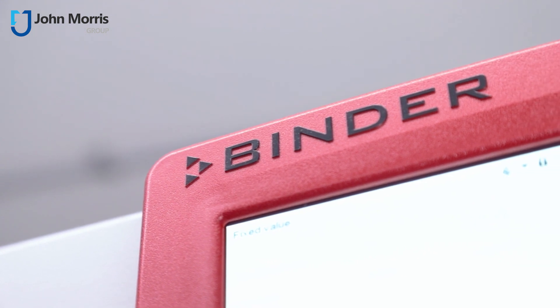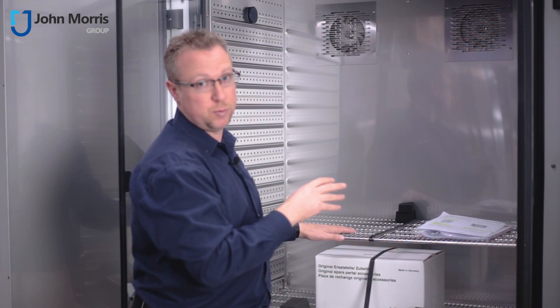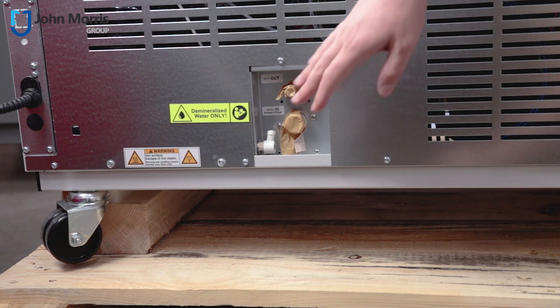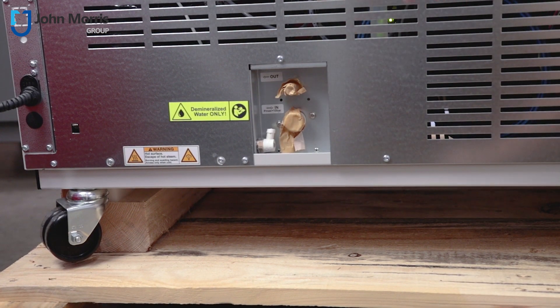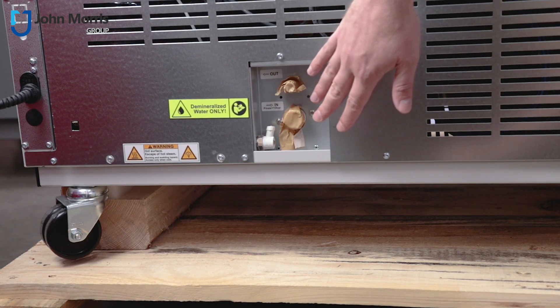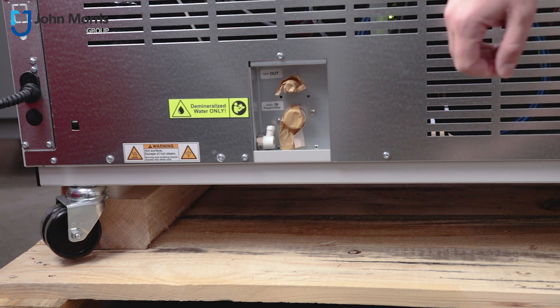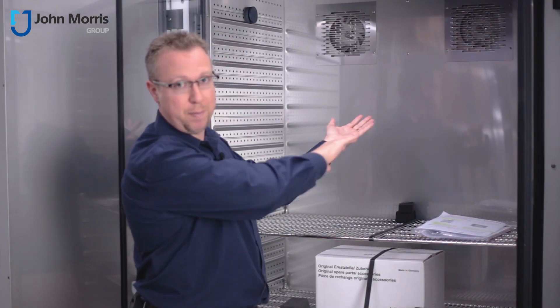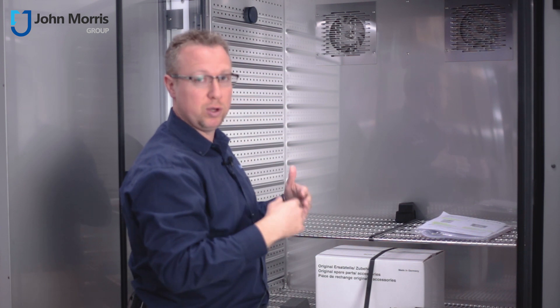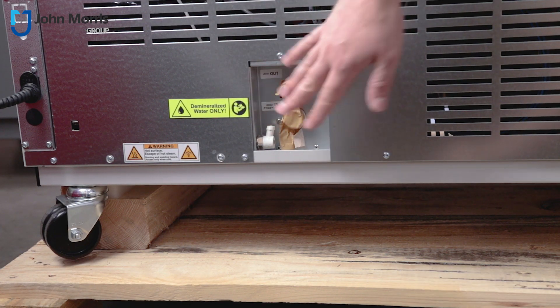The KBF series has very fast response times to humidity changes and temperature changes. In the back of this unit, you have automatic water management systems. That's really handy because water that sits still for too long can go off — you can get bugs growing in it. The Binder unit will actually cycle through the water sitting in the wastewater, remove that away, and make sure that fresh water is continuously brought into the unit.